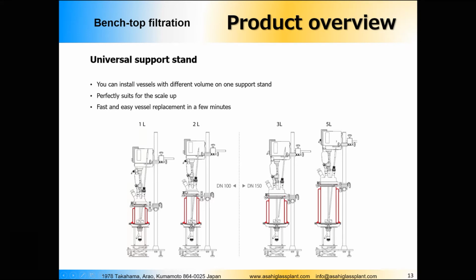when we have the stirring blade, which has the diameter close to the internal diameter of the vessel, you will need to insert the stirring blade somehow into the vessel. Well, in some cases maybe you can do that from the bottom, but it would not be that easy, especially when we have a very long vessel, and that would be a nightmare, believe me.